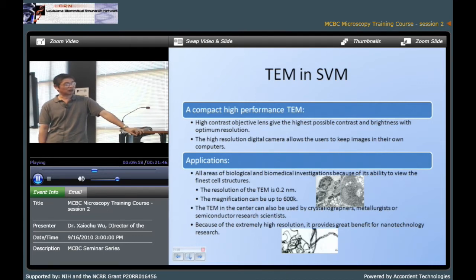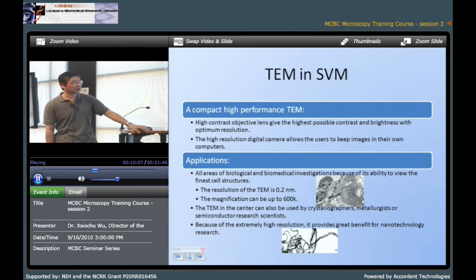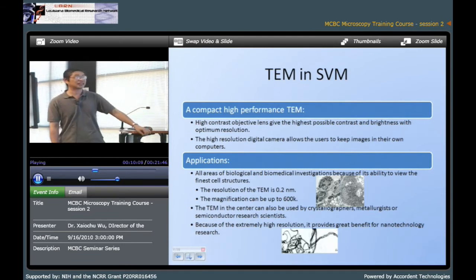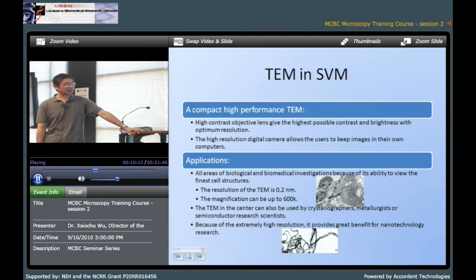Here are two images of carbon nanotubes. In the first picture you can see directly the inner tube and outer tube. And in the second picture you can see small particles attached on the surface of the nanotubes.